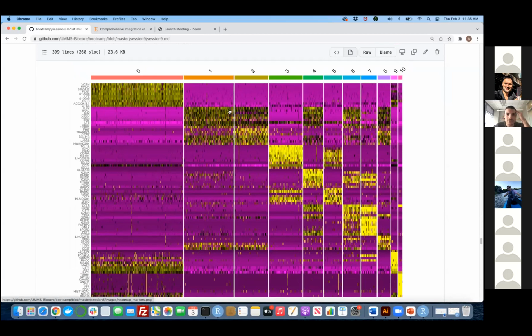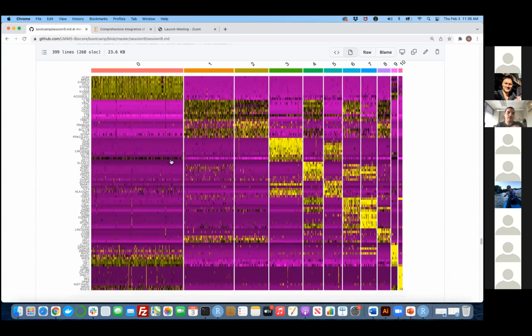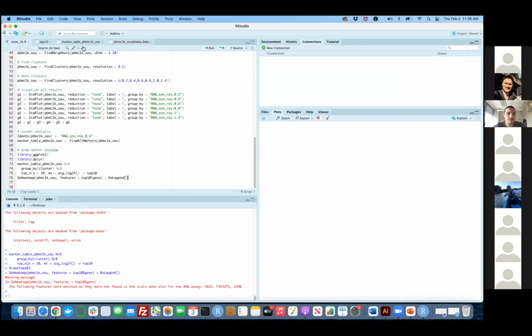The other thing, as you can see over here, is that this is probably the T cells that we are looking for. There are multiple clusters where some genes are shared across 1, 2, 3, 1, 2, 4, and 6. But some of these genes are higher and lower depending on where you're looking. And that is what we are trying to find. So this is an iterative method. You can't just pick it up by looking at the heat map alone. You have to look at the table.